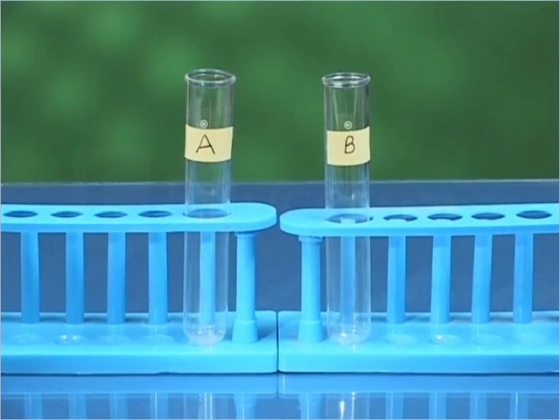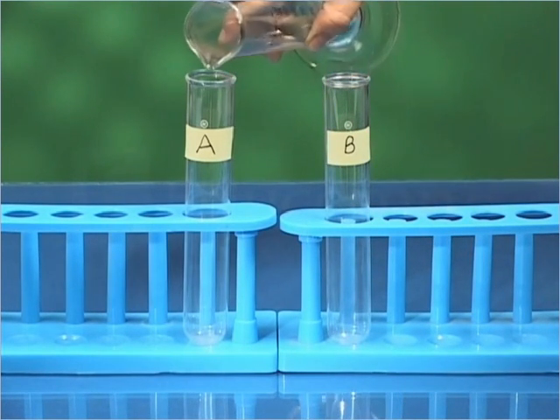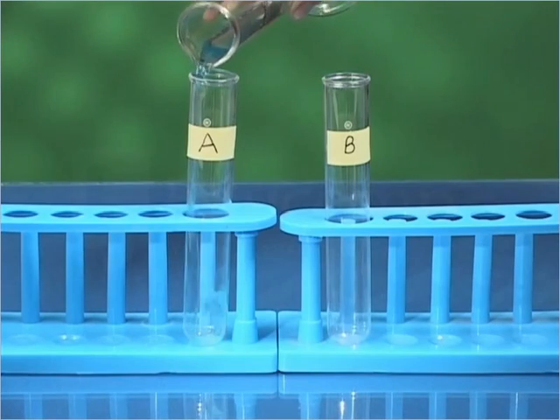Take two test tubes marked as A and B and in each test tube pour about 10 ml of copper sulfate solution.